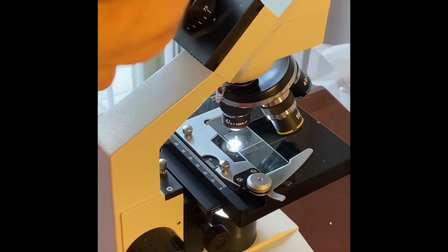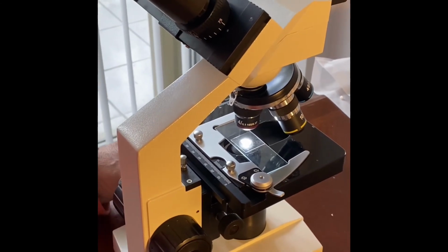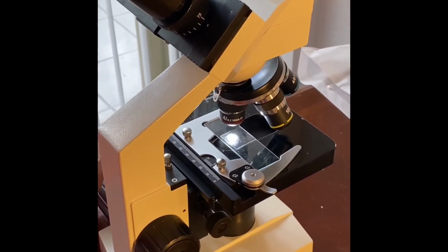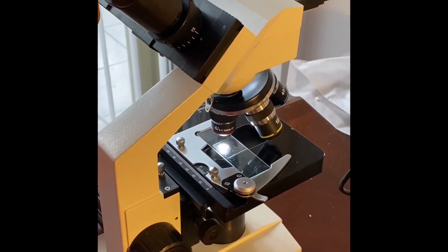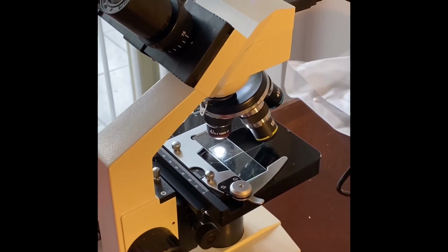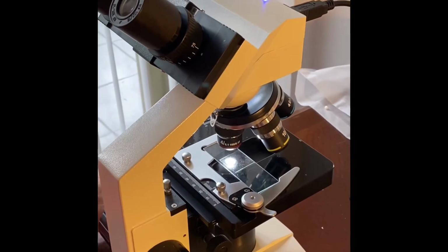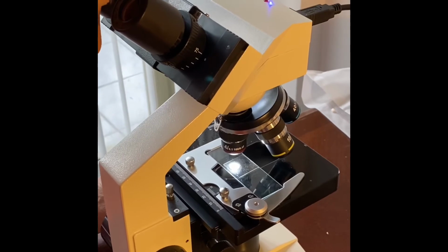You need to use the mechanical stage mover, and you could sort of eye it in and see that there's something that looks like a piece of paper there. You see the paper, but you don't see the letter E and what happens to it until you look through the microscope.